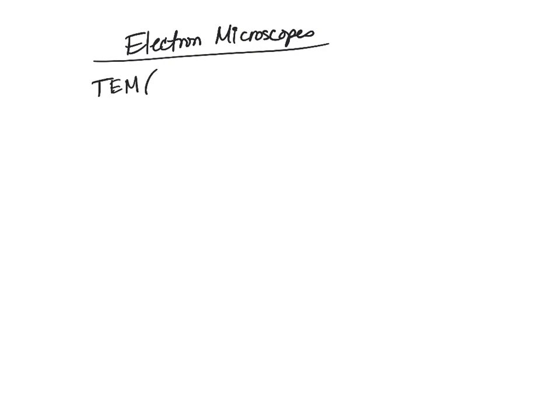So for our electron microscopes, remember we had two different types of electron microscopes. Do you remember what they are? So we had TEM, which are transmission electron microscopes.